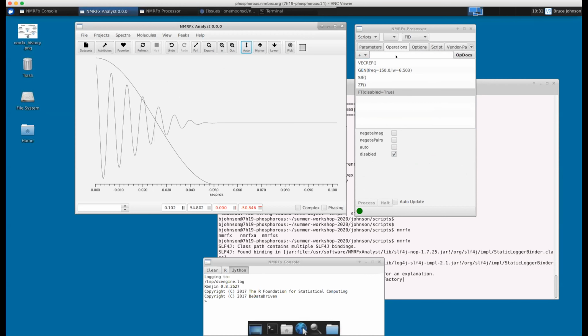What's become very popular, and I'm sure there was quite a bit of talk about it at the first workshop, and in a few weeks you'll hear about, I think, SMILE processing for NUS processing. You hear quite a bit about NUS processing, so let's look at that real quickly.